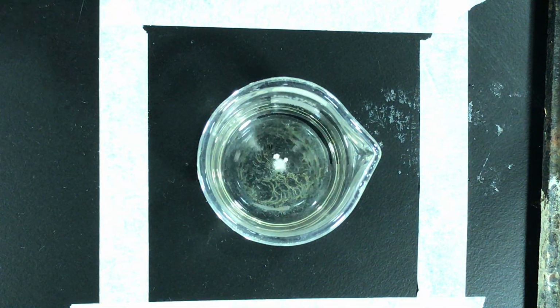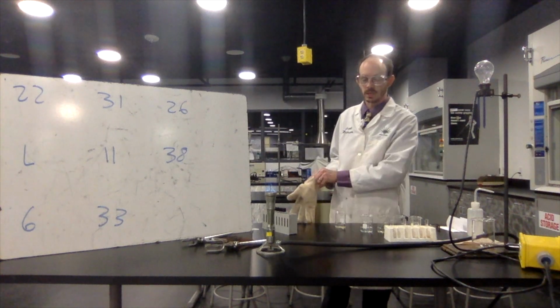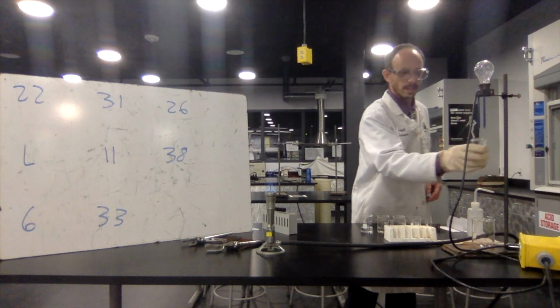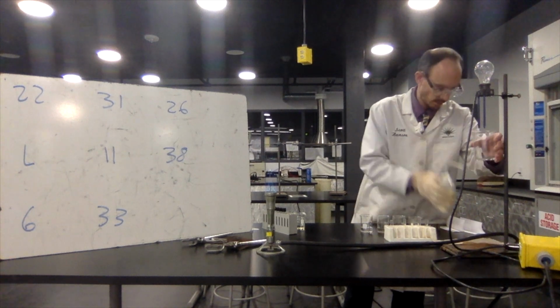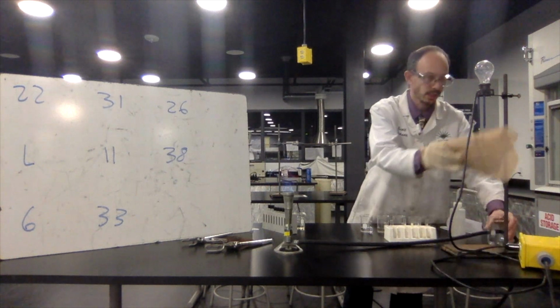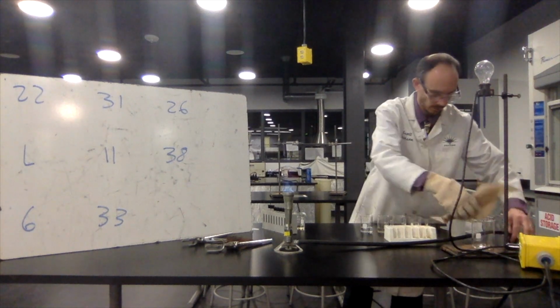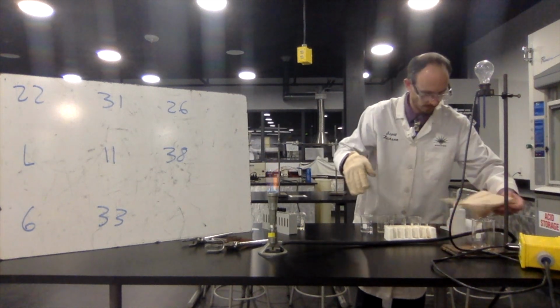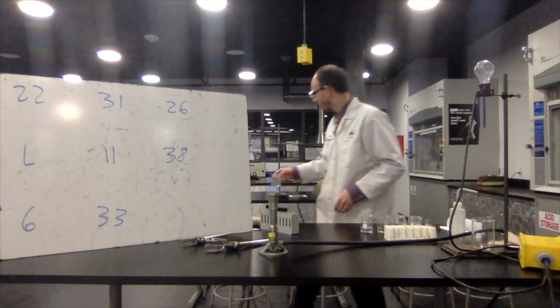That looks pretty soluble. I put a heck of a lot more in there than what you're still seeing in the bottom there. So did it completely dissolve? No, but we could say that this is a successful solubility test. Electrical conductivity, nothing. But something I am going to do this time is I'm going to rinse the electrode since we did have some solubility. And now, I'm going to stick this beaker over here.